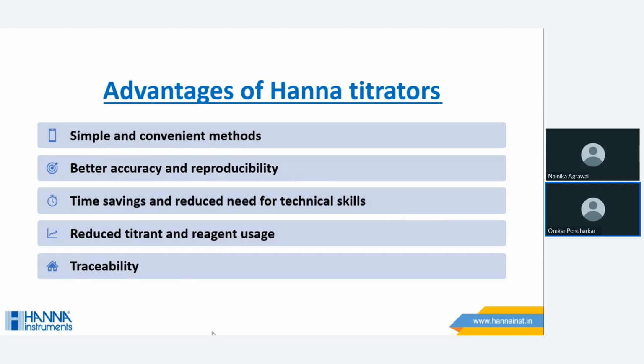Then the next advantage of the potentiometric data is traceability. So every parameter you have analyzed will get automatically stored inside the titrator.